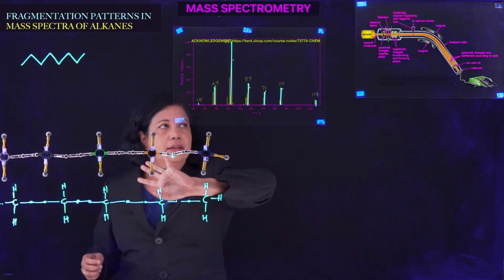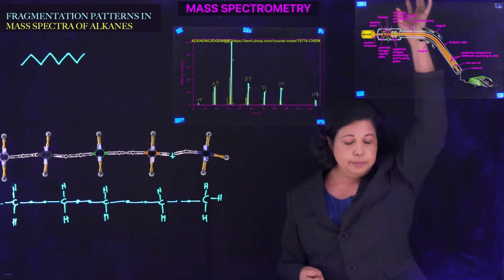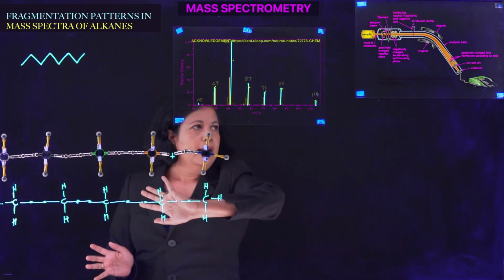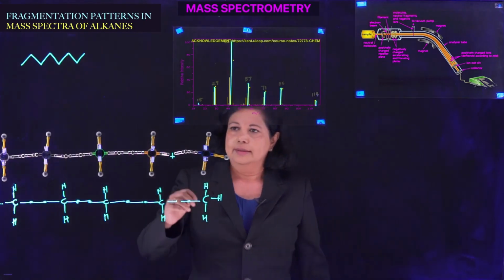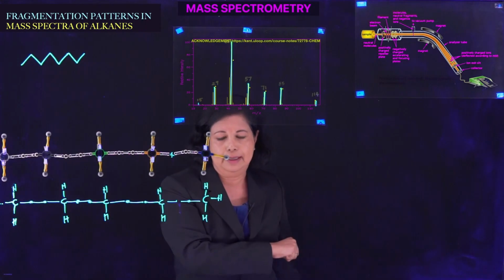So the molecule then goes through, and all the neutral parts get sucked up through the vacuum pump, and it gets accelerated and goes through that magnetic tube and gets thrown onto that detector. It's a weak link on the chain. It's going to pull everybody out.